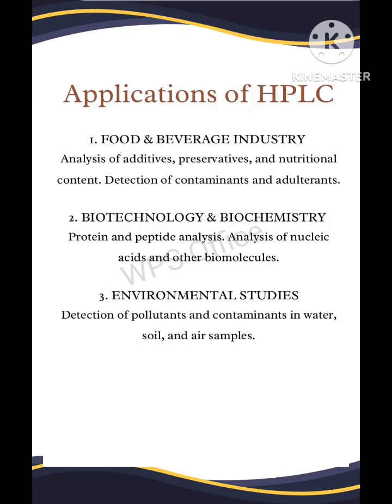You might be wondering how this applies to your work. Now let's dive deeper into how this works. These are the applications of HPLC, which is used in food and beverage industry for analysis of additives, preservatives, and nutritional content, detection of contaminants and adulterants. It is also used in biotechnology and biochemistry, protein and peptide analysis, analysis of nucleic acids and other biomolecules. In environmental studies, this technique is highly used for detection of pollutants and contaminants in water, soil, and air samples.